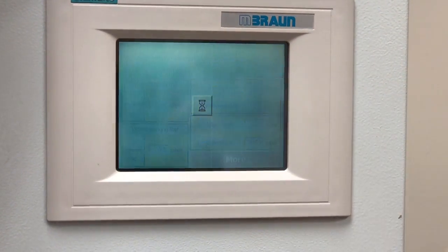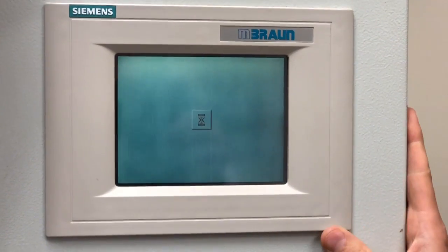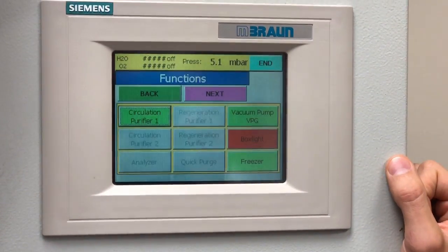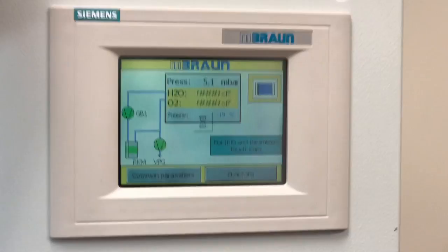Then we go back — this actually saves the settings. We go to 'Functions' and we can turn on the box light. Then we can go inside the glove box.